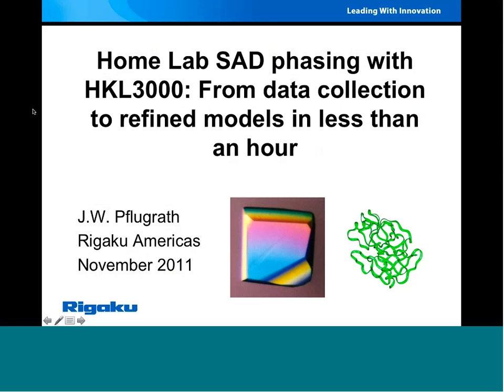Great. Okay, sure. Thanks a lot, Angela, and thanks everybody for stopping by to watch this webinar. It's an unusual one for me because I'm talking about something that I use, but I actually haven't really contributed to the software for this. And as we go along, I'll try to show 3 examples.